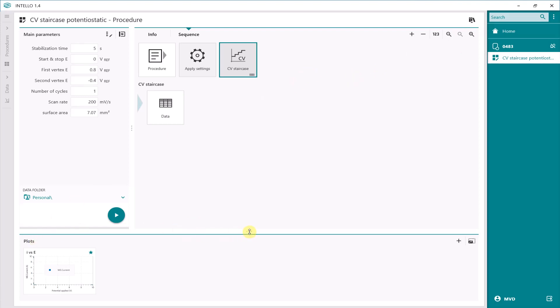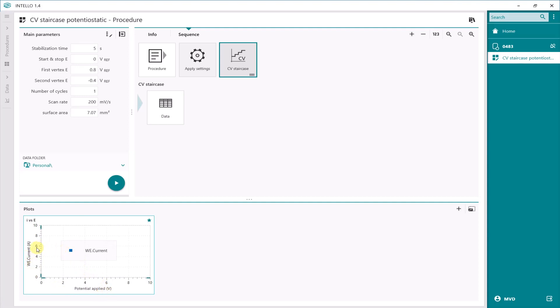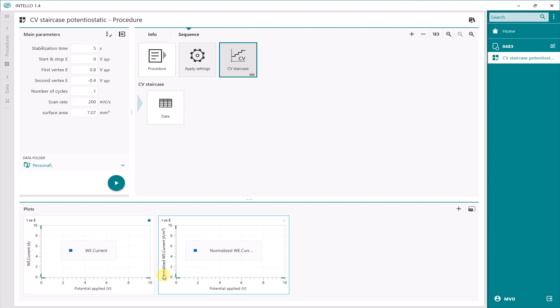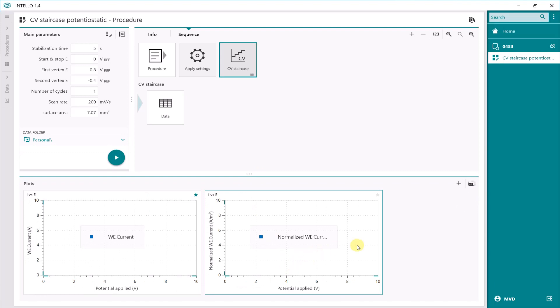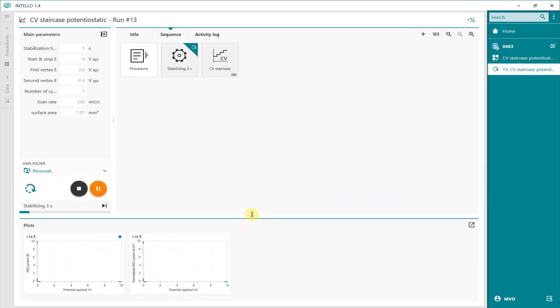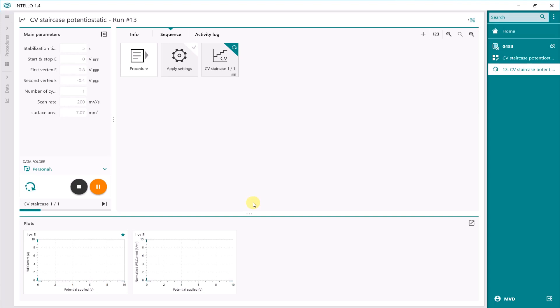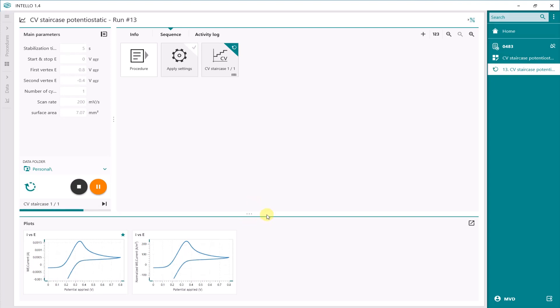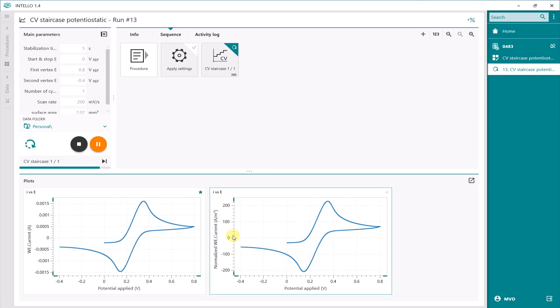The unit is amps per square meter. In terms of plotting, the standard plot is I versus E — the current versus the applied potential. But if you drag and drop the CVStaircase into the plot ribbon using the normalized signals option, you will find normalized current in amps per square meter. This is the current density plot. We start the procedure — there are 5 seconds of stabilization time, then the measurement starts. You will see the same type of plot but with different values on the y-axis.